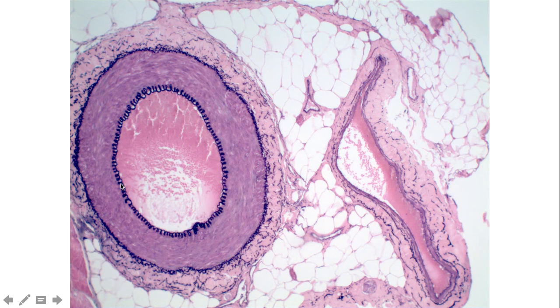This is the internal elastic lamina, and then the outer external elastic lamina. And so these two elastic layers, both on the inside and the outside, become a very nice defining feature of these muscular arteries. And so if we were to look closely, and we'll look at the next slide, there should be a very thin tunica interna, which we can't really see here, it's too thin, followed by then this very nice purple prominent line, the internal elastic lamina.